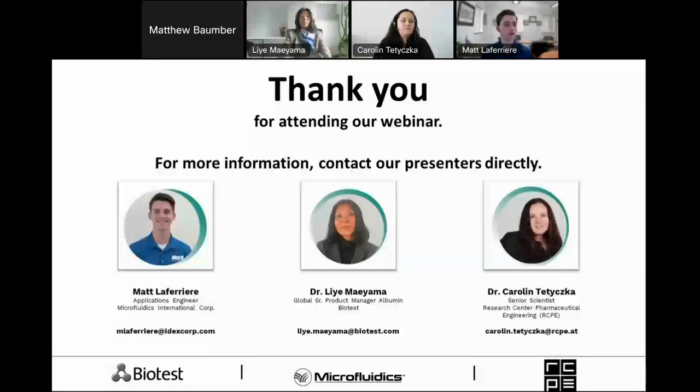Thank you. We have a couple more questions before we wrap up. Along the same line of filtration, we have a question that says, did you try to sterilize through 0.22 filtration? What kind of membrane material did you use, and what was your filtration yield? We did not filter it after preparation. We just used these special Amicon filters to separate our supernatant, the aqueous phase, from our particles to investigate the encapsulation efficiency.